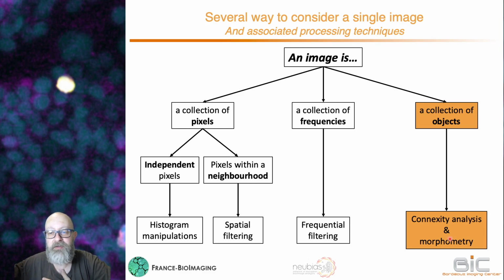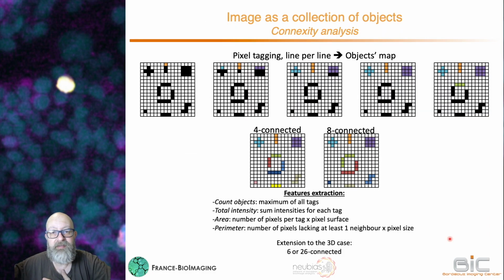So what is connexity analysis? Well, in fact, it's not that complicated, and it's depicted on this slide. We first start with the mask, where here you've got black pixels that are belonging to objects and white pixels that are considered as background.